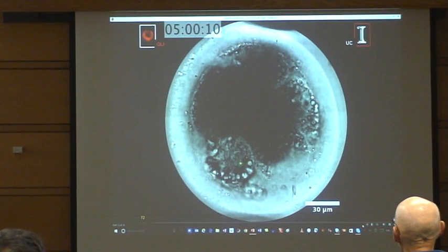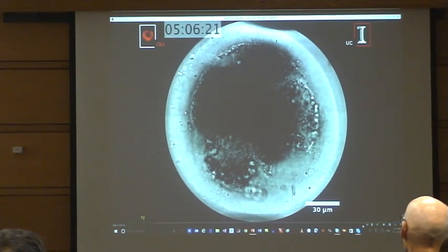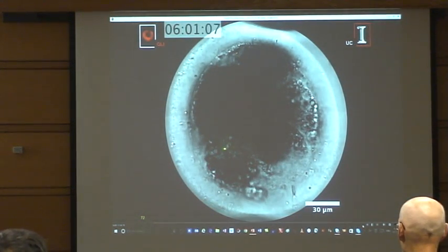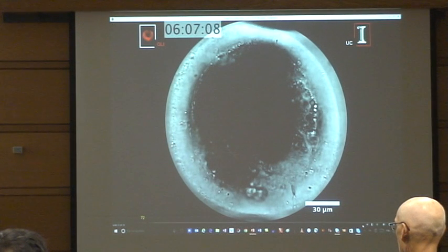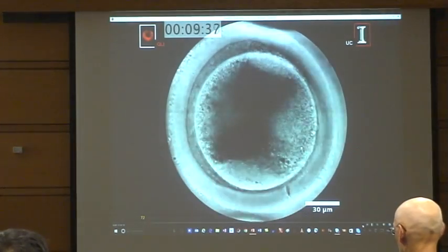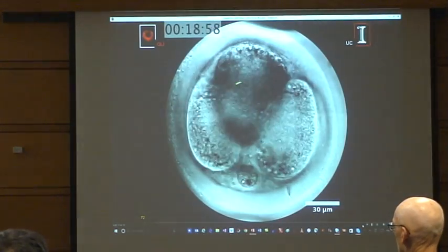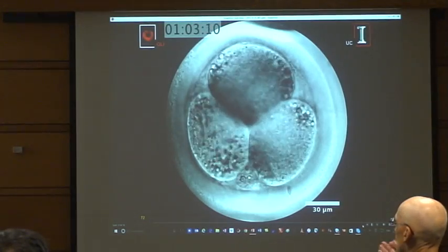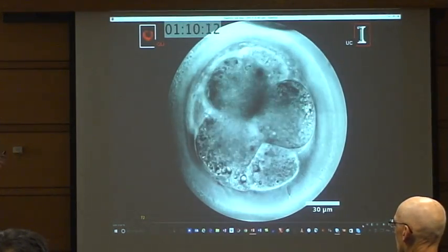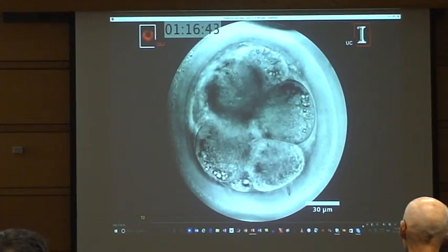See? And the interesting thing to me is that when a cell breaks apart, it moves a lot, like pieces fly all over in diffusion. When this thing dies, it jellos. So it looks like the viscosity of the whole thing went up, which means that there are a lot of active processes that move these things around. I always have thought they were diffusion. Is this a consequence of environmental changes in the medium? To be honest, we don't know for sure.